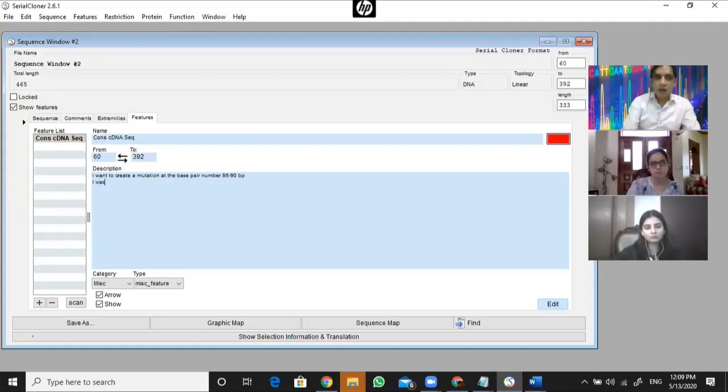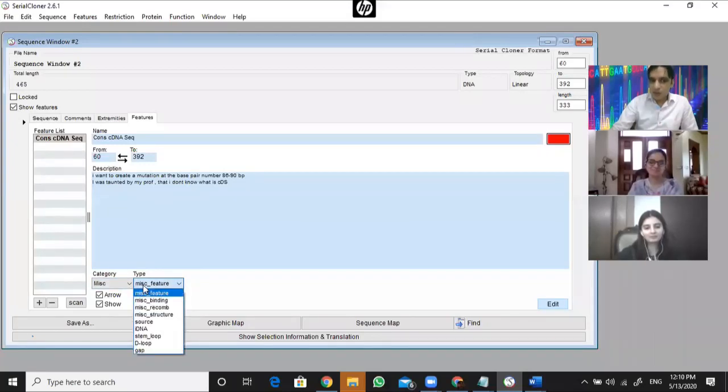Okay? I was taunted by my professor that I don't know what is CDS. So whatever the things you want to record, and then you can add some other things as well. Other things is a primer sequence, or an operon, or binding sites, protein binding sites, or whatever. But right now I'm just leaving it as a miscellaneous feature.